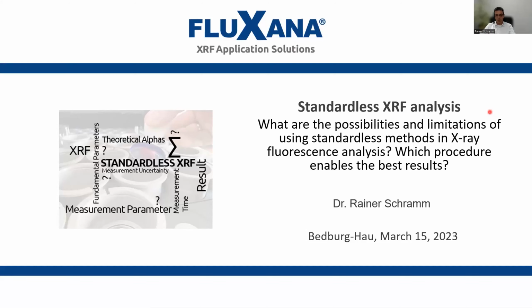My name is Rainer Schramm, and I would like to talk today about the possibilities and limitations of using the standardless method in X-ray fluorescence analysis. I think most of you who are working with XRF instruments have software on board which is able to do standardless analysis.